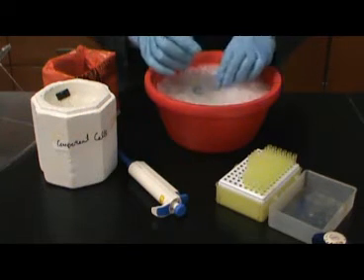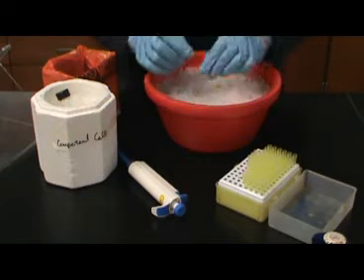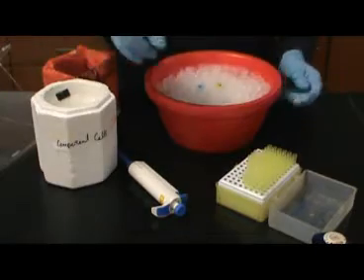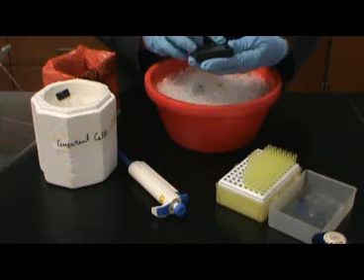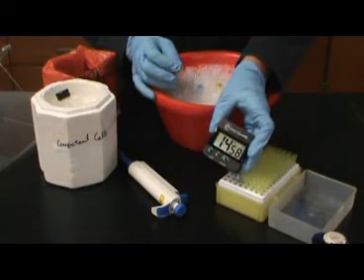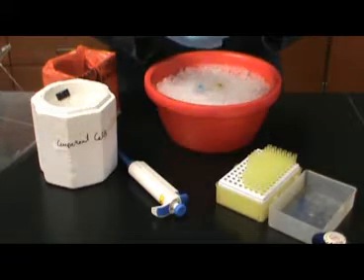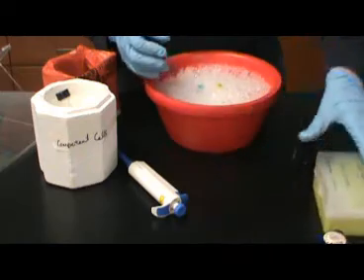Once the competent cells have been introduced to the positive and negative tubes, gently tap the tubes to mix the E. coli with the plasmid and water, and then allow the tubes to sit on ice for about 10 to 15 minutes. 15 minutes is the preferred time, since during their time on the ice, the actual uptake of DNA is going to occur. You may want to use a timer for this part of the experiment.